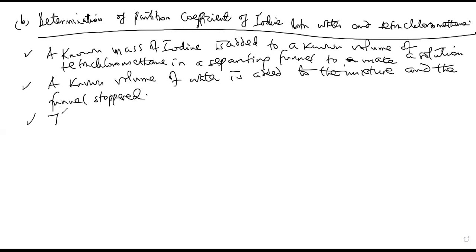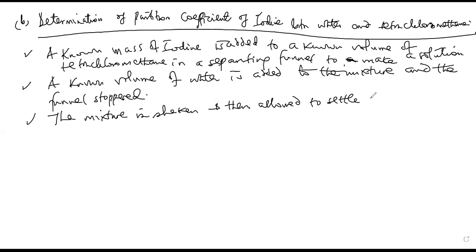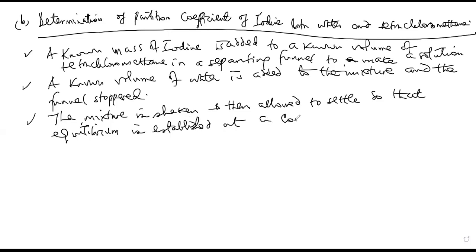What next? The mixture is shaken and then allowed to settle so that equilibrium is established at a constant temperature.